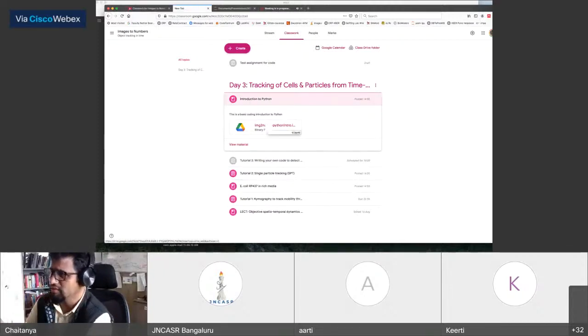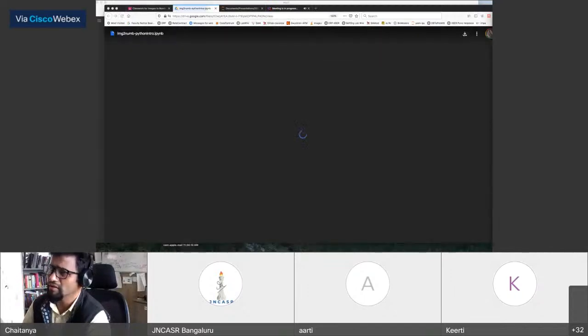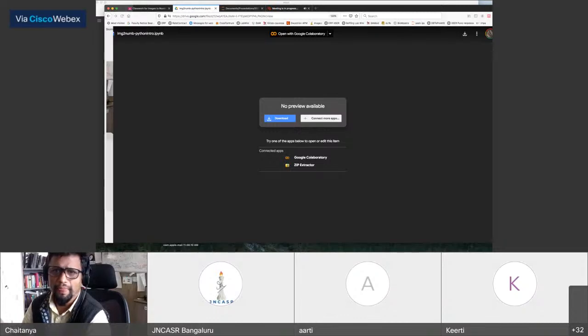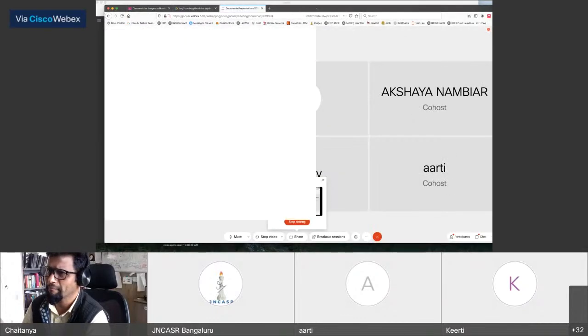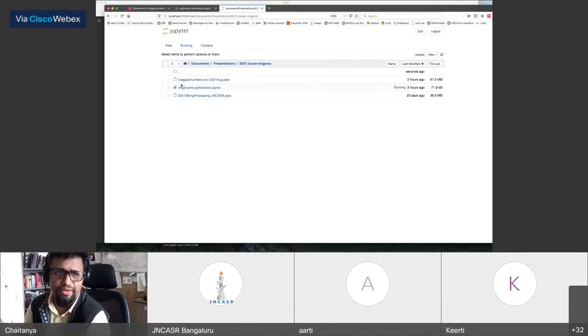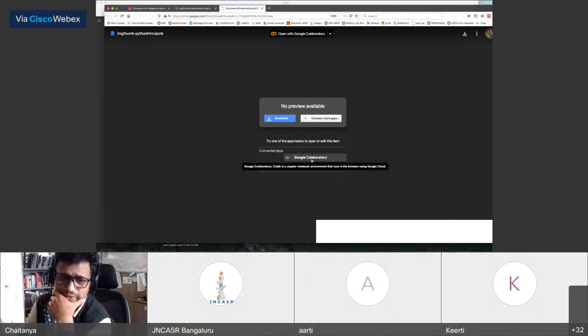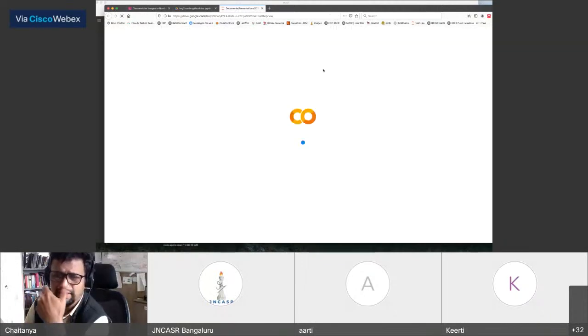Click on this. And this brings up this window. And what you should be able to do is click on Google Collaboratory and see this. Okay, it takes a few seconds, so give it that much time.